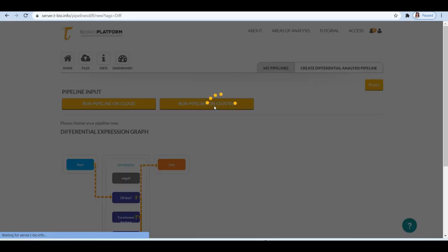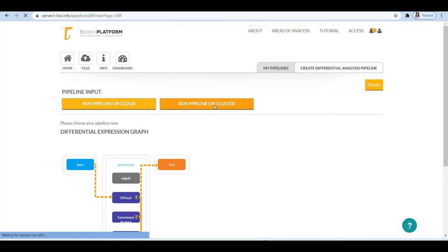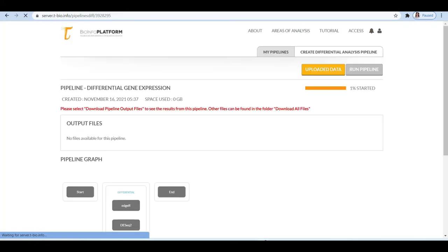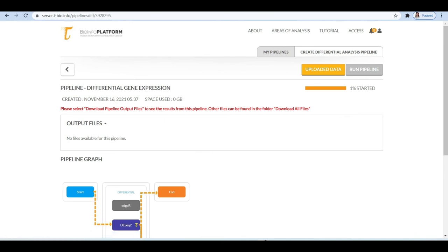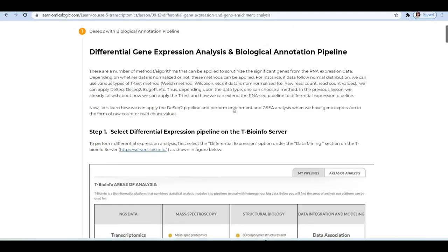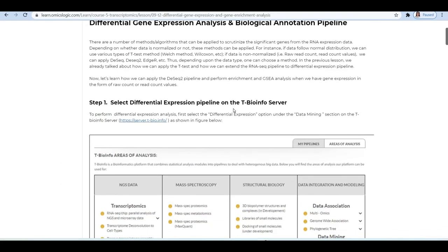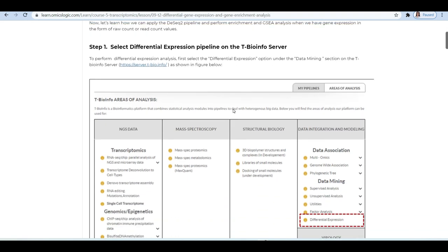Once your analysis is complete, you are going to get various plots. The first one would be the volcano plot and the second one would be the enrichment and the GSEA plot. Also, you are going to get a DSEC all.text file which is going to tell you about the differentially expressed genes in the tabular format.